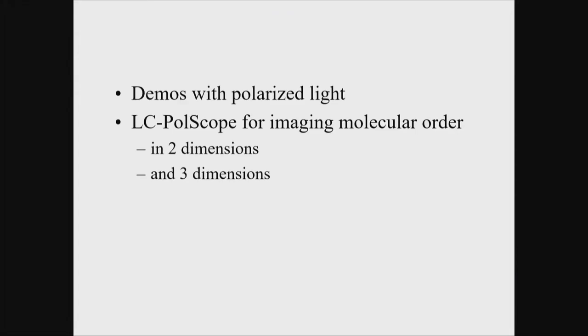Let's see. So unfortunately, the demos didn't quite work out. But I will tell you about this LC-PolScope technology that we developed. Polarized light imaging was used in 2 dimensions in particular, where you can learn orientation in the plane perpendicular to the viewing direction.